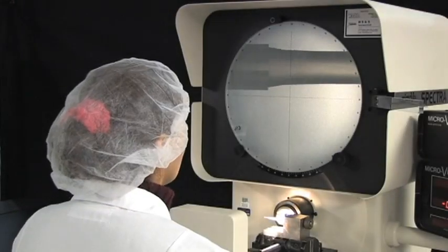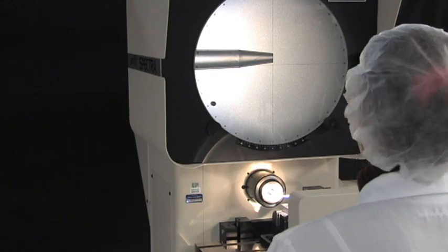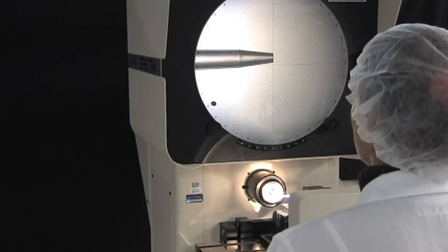Next generation refill tips are made only from virgin medical grade resins and are carefully inspected to ensure they work well on your pipettes.